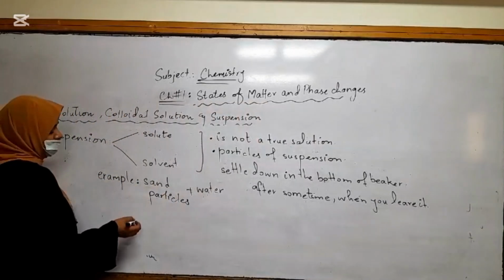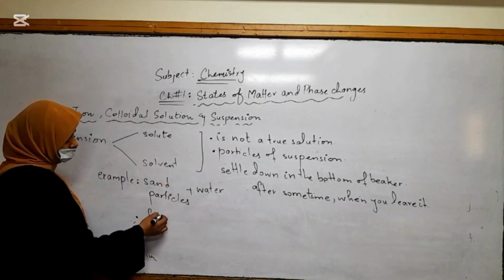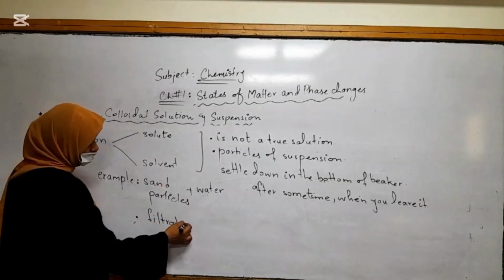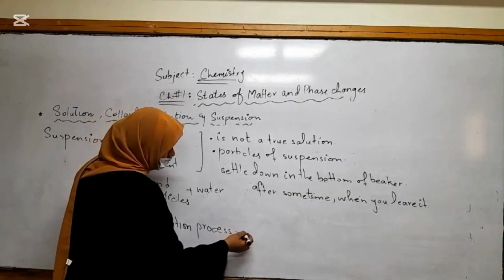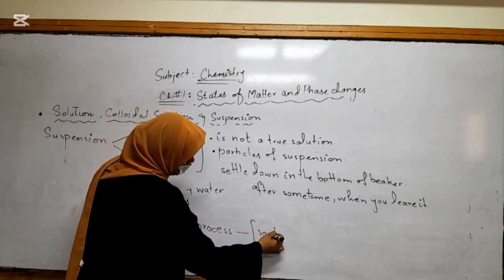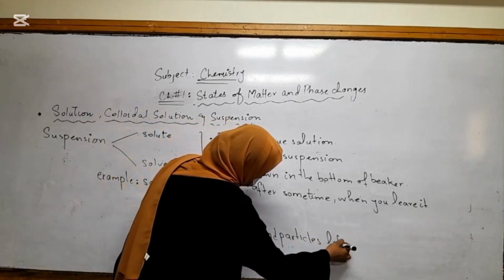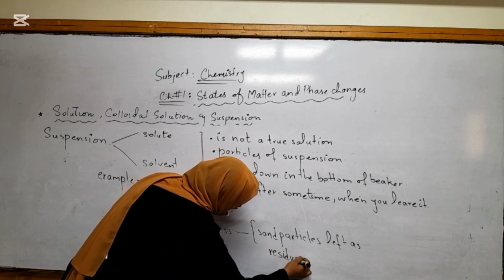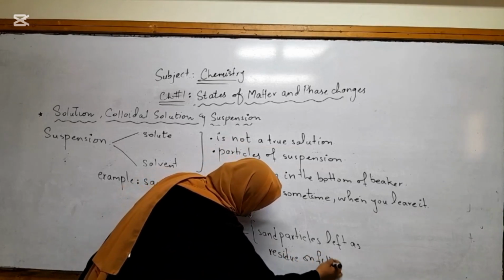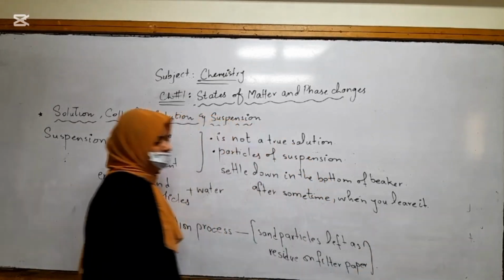So when I mix the sand particles with water, after filtration you can see sand particles left as residue on the filter paper. So this is how a suspension is formed.